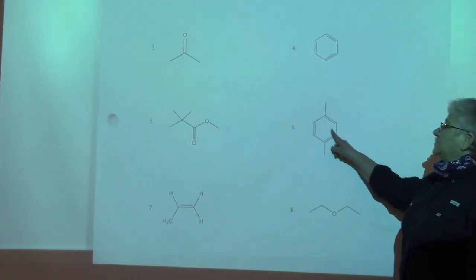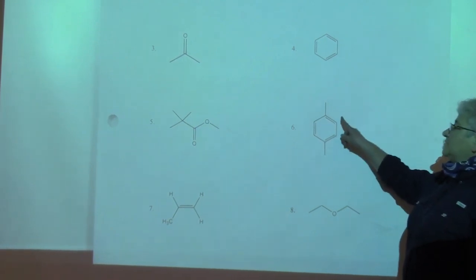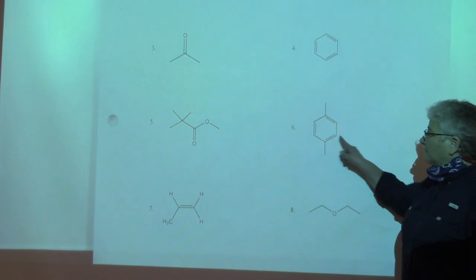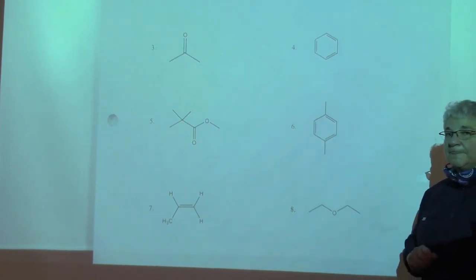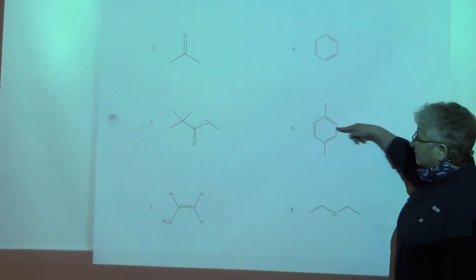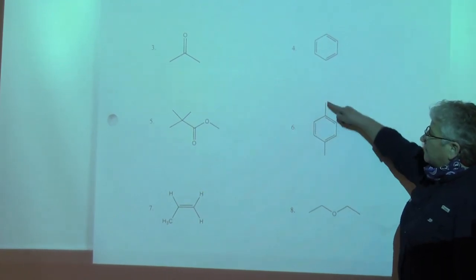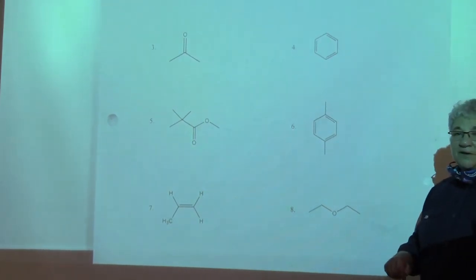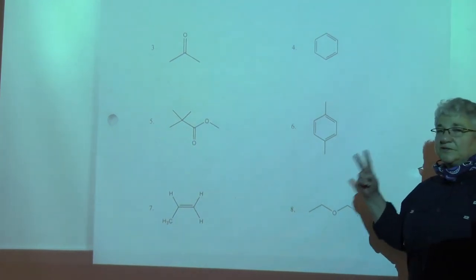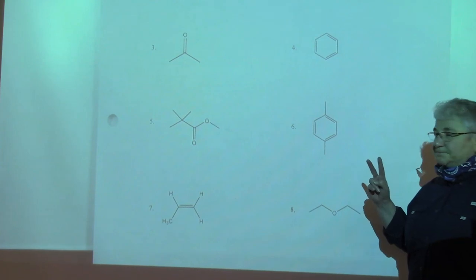And if that hydrogen is the same as that hydrogen, and that hydrogen is the same as that, and so on, you can see that these 4 hydrogens are all the same. And these two methyl groups, if I fold along the center of this molecule, that methyl and that methyl are the same. So for this molecule, I would have anticipated 2 different types of hydrogens.